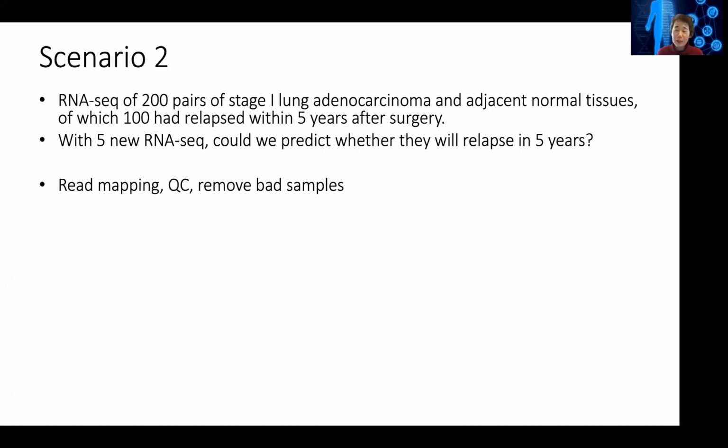So that will save you some time. RSeQC unfortunately doesn't directly run on FASTQ. It runs on the BAM. That's why we still need to do a little bit of STAR mapping. One way to do that faster is you don't need all the reads to run STAR. You can just subsample, say, 5 million reads. So supposedly each sample is sequenced at 50 million reads.